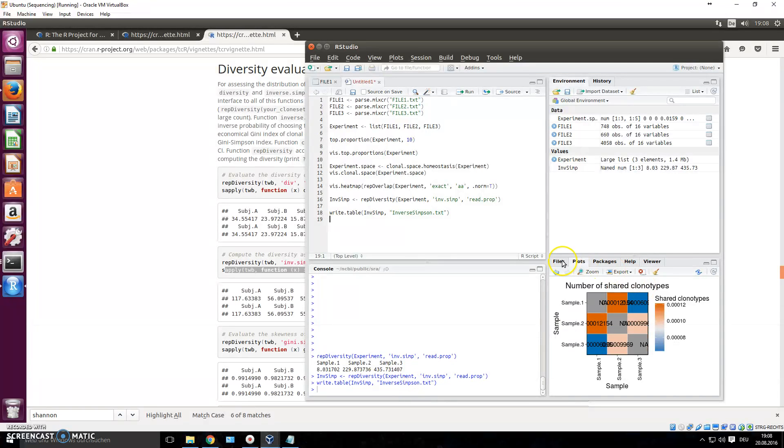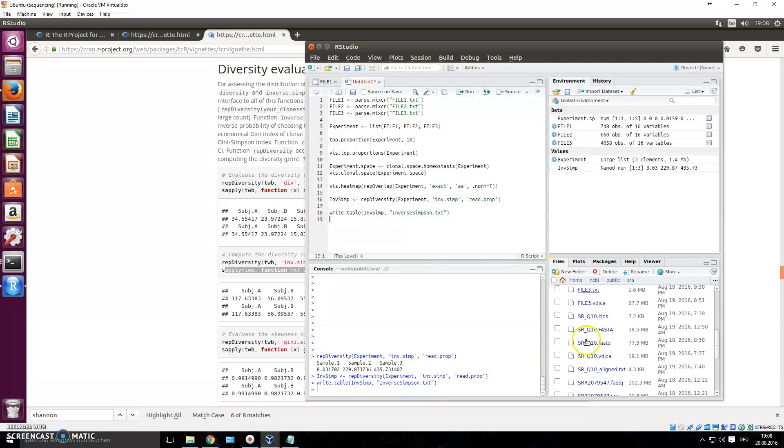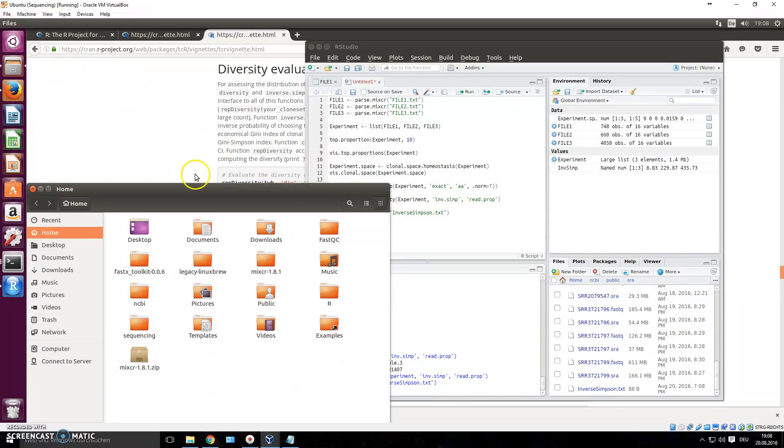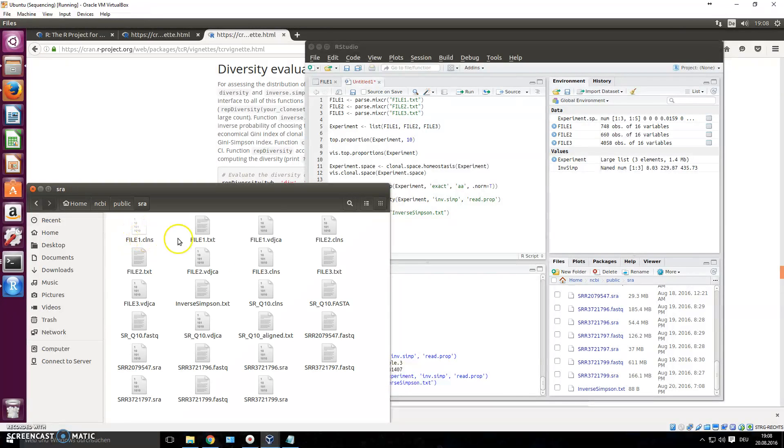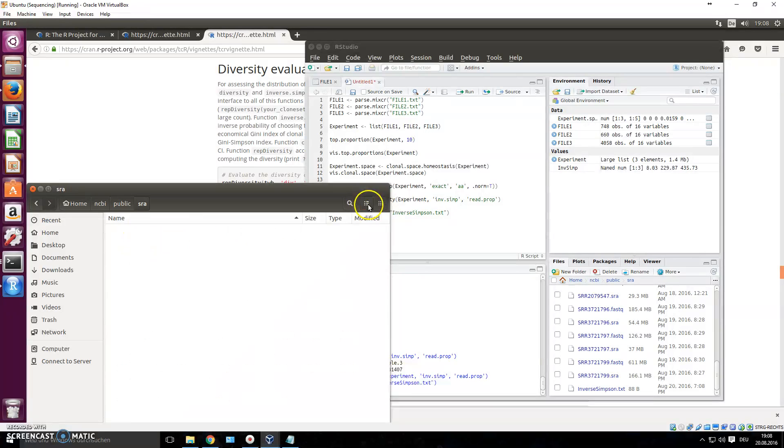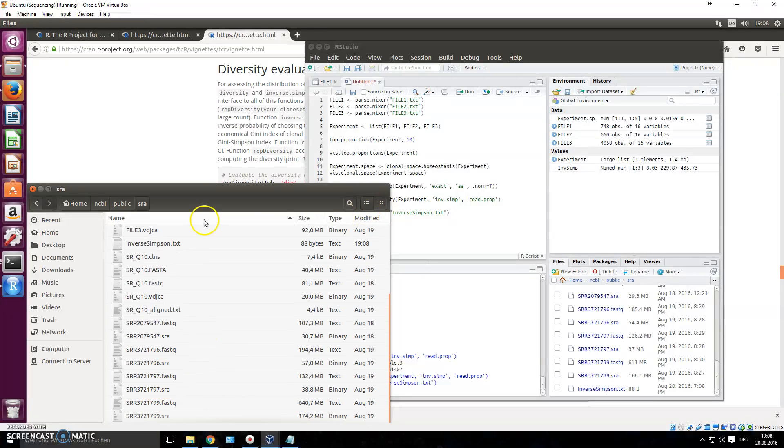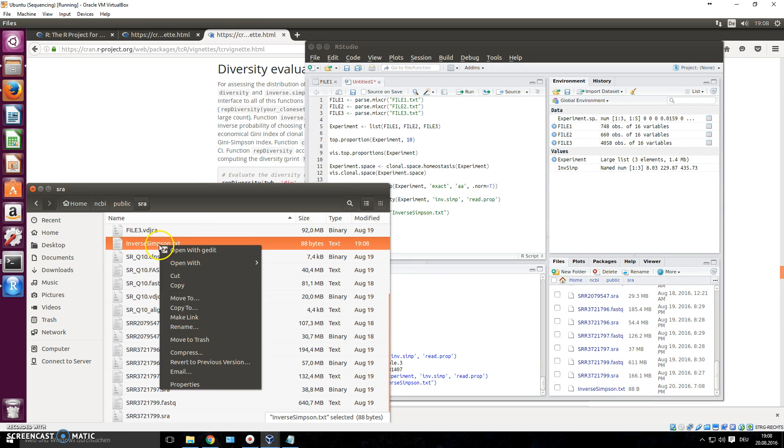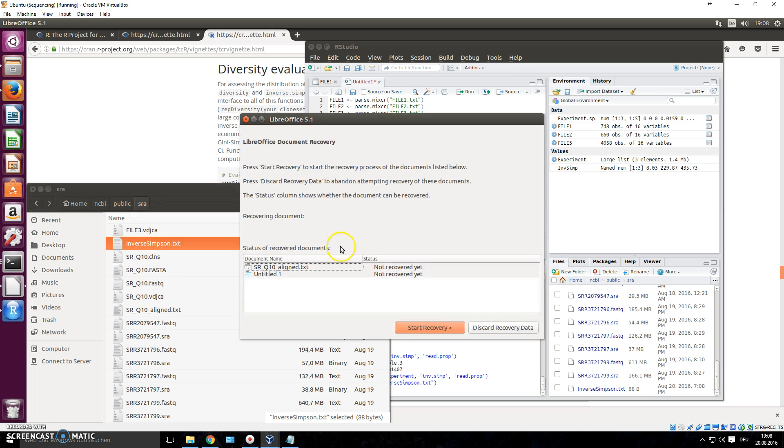Now, you could go to your files. And here, there should be a file called inverse Simpson dot txt. So we'll go through our browser and find that one. Okay, there we go. And there it is, right here.